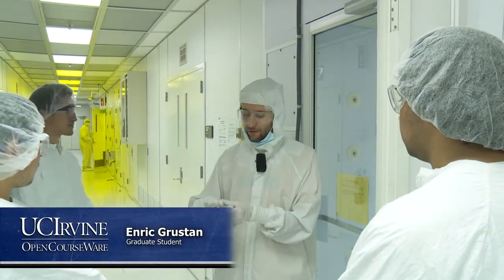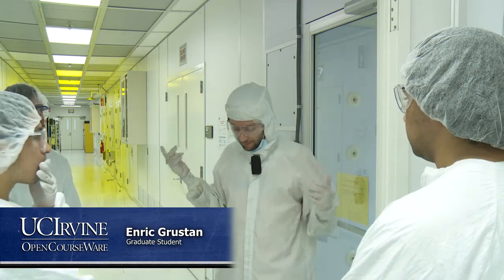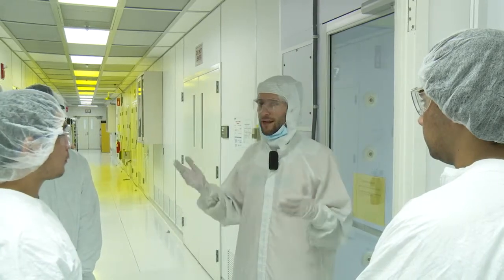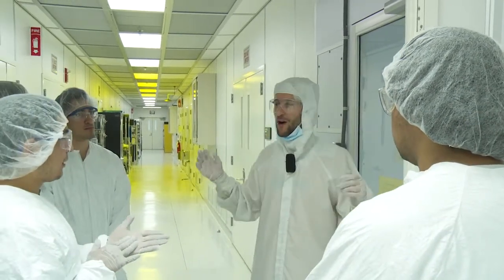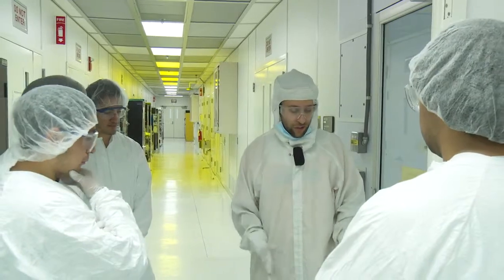If you were processing, probably instead of just one pair of gloves, two pairs of gloves. The glasses, I usually wear my own glasses, but I come straight from home, so those ones are fine. You shouldn't need them, but better safe than sorry. And also, I'm a super user here, so let's try to be proper. So that's why you have glasses. The hoods, like double covers for the shoes, and that's it.